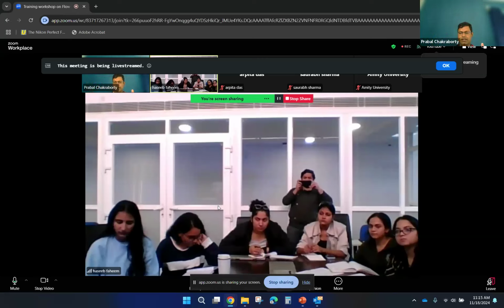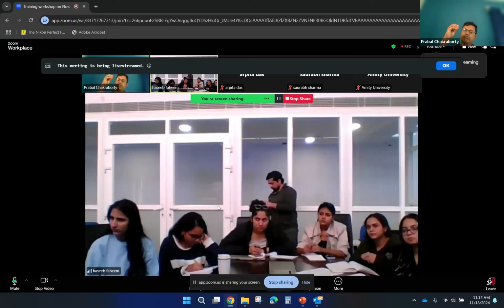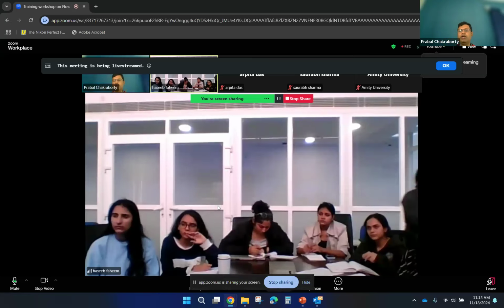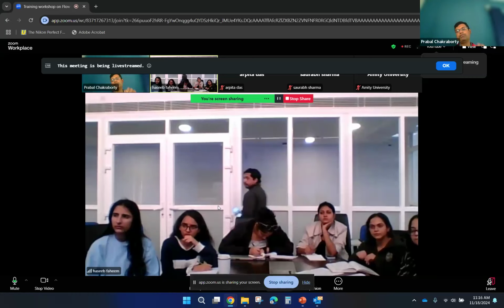So that is how, inside a cell, you can understand the location of the nucleus, the location of the actin fibers, and there is another small molecule which is called mitotracker. So mitotracker binds mitochondria very specifically. It does not bind to lysosome or Golgi body or endoplasmic reticulum particularly. So it binds only to mitochondria. So if you incubate with a mitotracker red, or sometimes there is another version also, you can see the mitochondria under the red color or red fluorescence light. Okay, so that is how, if you put different molecules, you can stain a specific structure inside the cell, and you can understand the location of that particular structure.